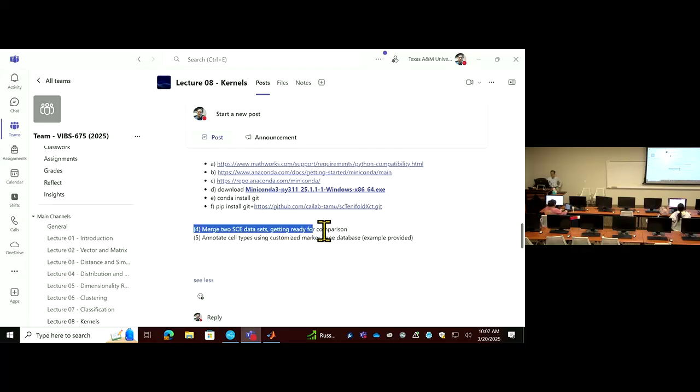If we still have time, I will show you how to merge two data sets together using different examples. I showed some of this before. If you have processed data saved on the hard drive as two separate files, you can combine them. You can also directly download two files without even saving them, and just process them in memory directly.